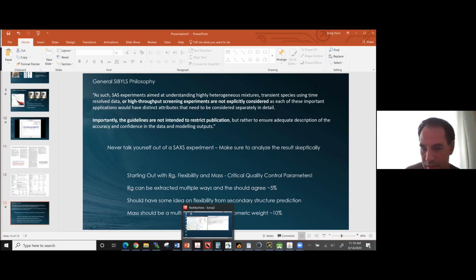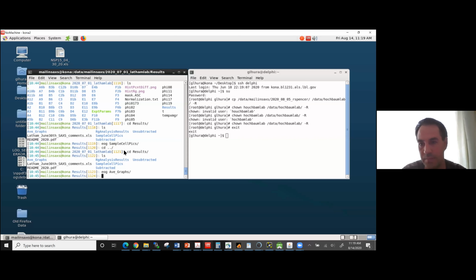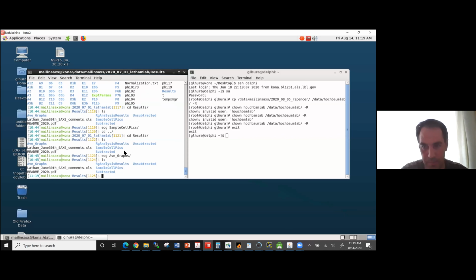All right, and I'm approaching that mark there. So I'm just quickly going to go through. I'll try to get that paper in the chat. So let's see.